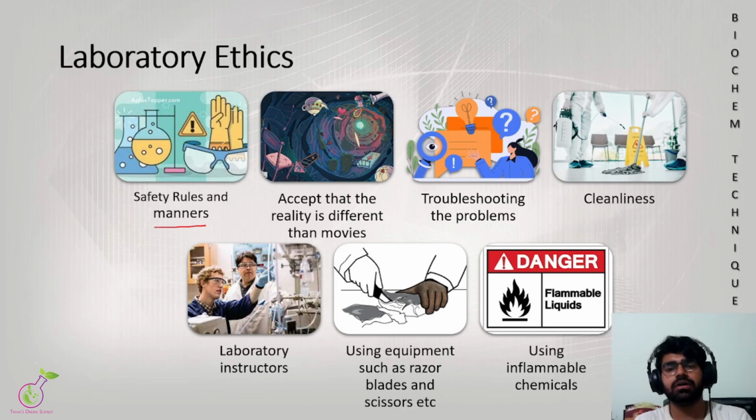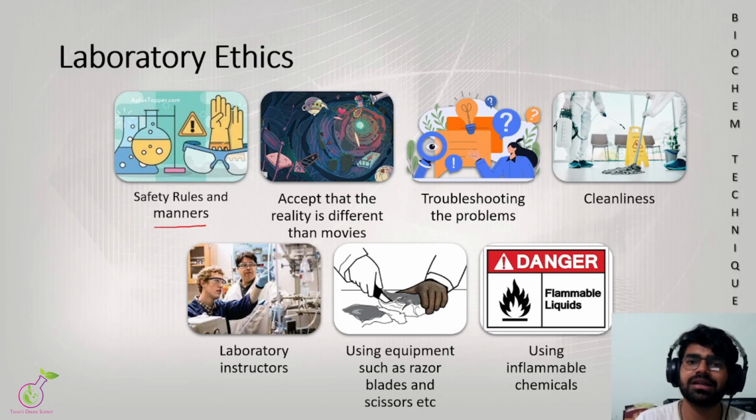Why are we very careful about these things? Because bacteria are very sensitive things. Even one bacterial cell can replicate. If one bacterium falls on your culture plate, your whole experiment, a month-long experiment, could go to waste. So we have to be very careful about cleanliness in the lab and our experiments while working on different projects. Laboratory instructors are very skilled people that help you in almost everything you are dealing with in the lab.